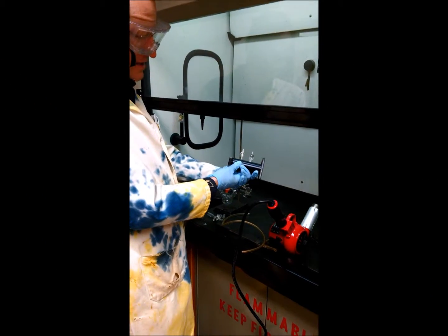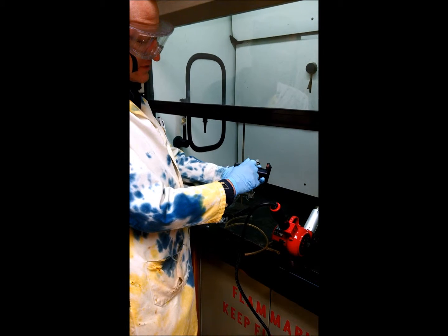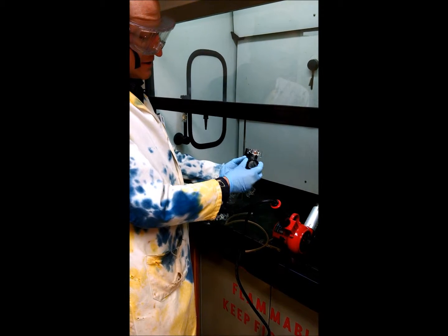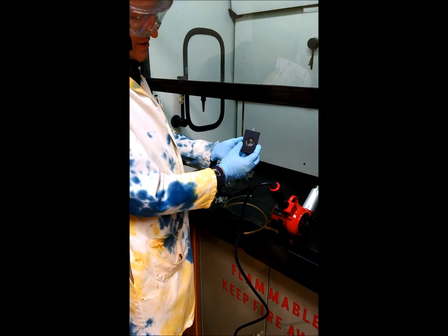This is the gas cell for the infrared spectrophotometer. You can see we have two valves to let the gas in and out, and we have two windows at each end of the tube.